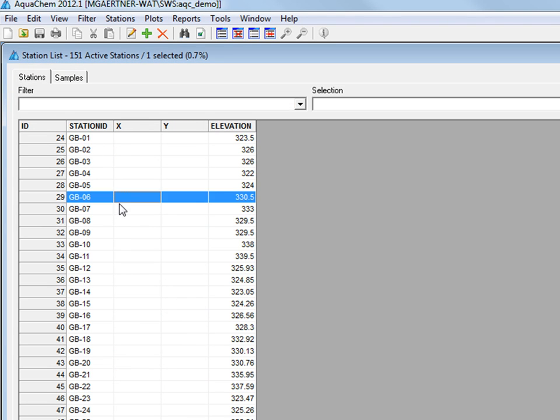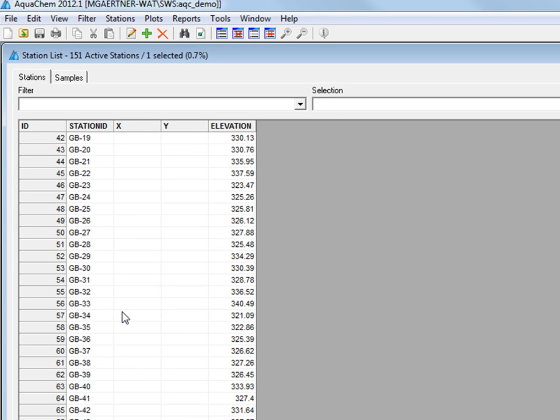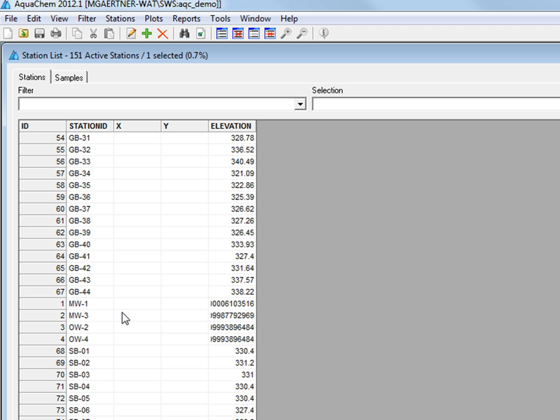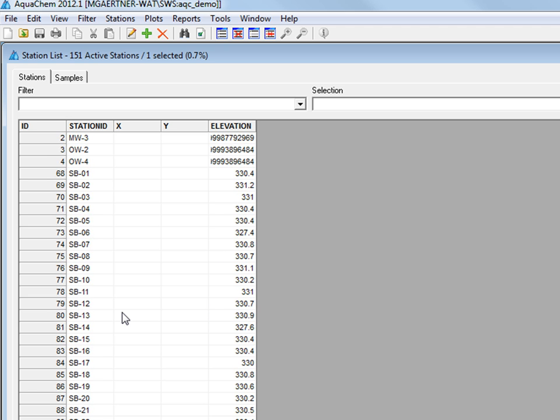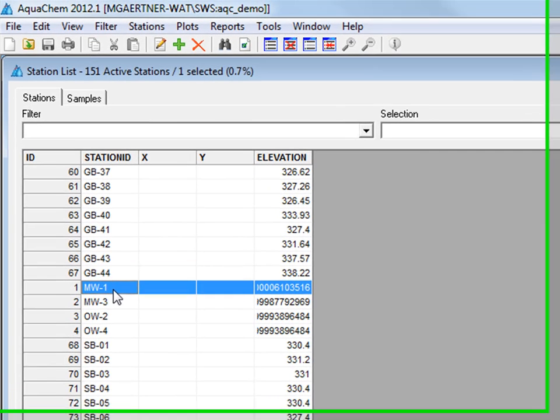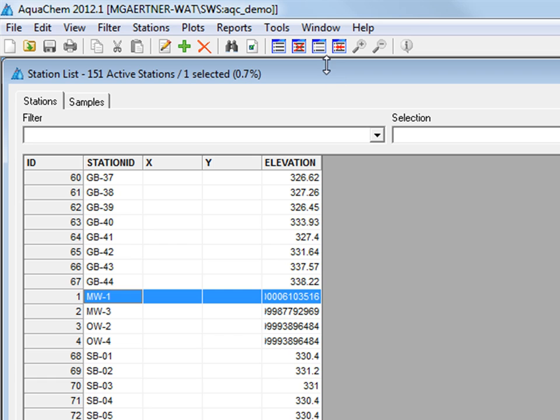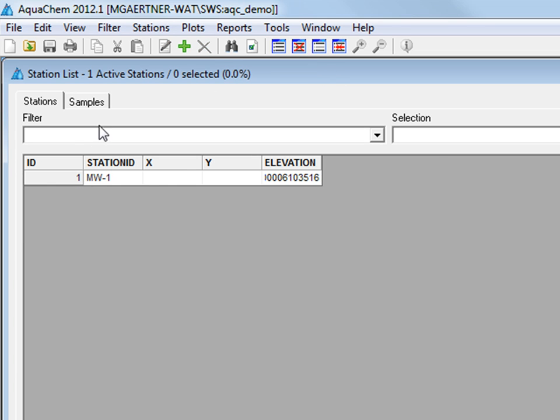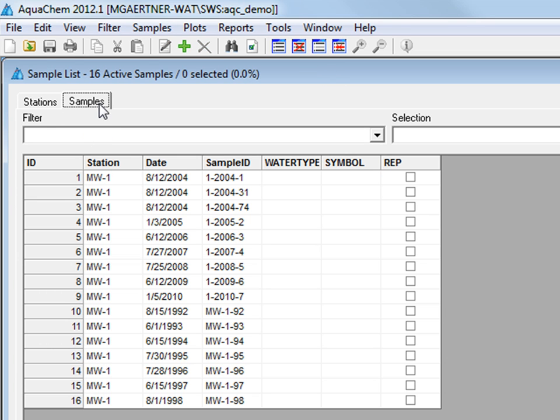You can scroll through your stations to find an appropriate one. Here's MW1 where I've entered in some chemistry data. Then I can look at the sample data and I can continue my analysis within AquaChem.